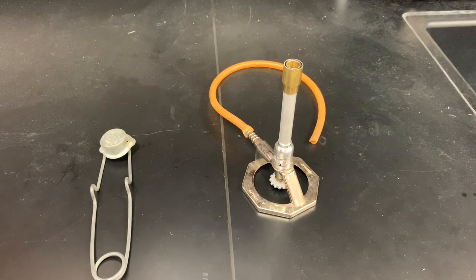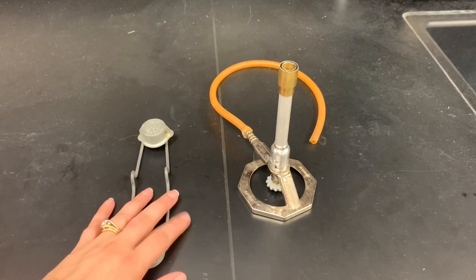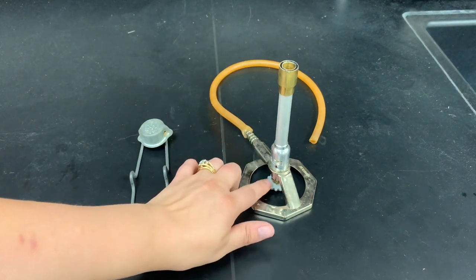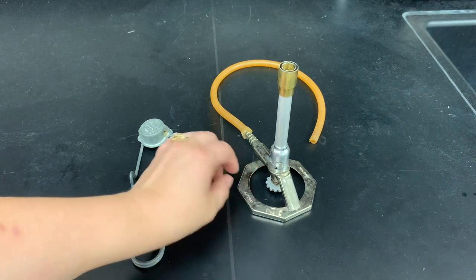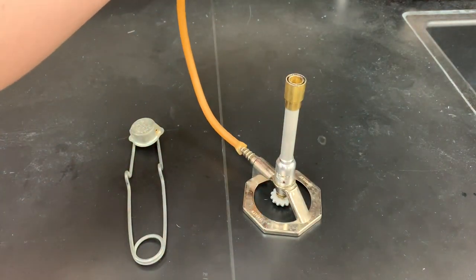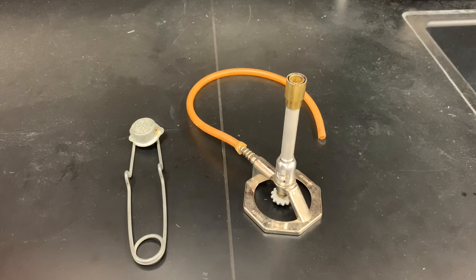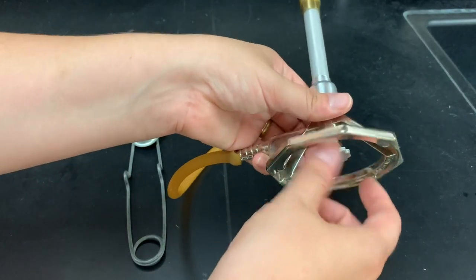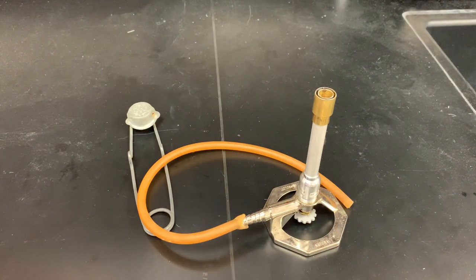The first thing I want to talk about is the structure of a Bunsen burner and how it works, and also the striker. The Bunsen burner has three major important parts: this down here is the gas valve, this up here rotates and these are the air intake inlets, and this right here connects to your gas line — that is your fuel source. We can adjust the amount of gas flowing in by twisting the knob at the bottom, but most of the time it's easier to adjust the gas from the valve rather than from the Bunsen burner itself.